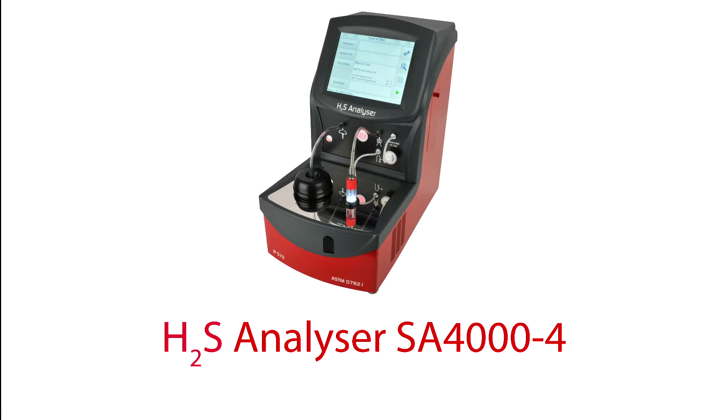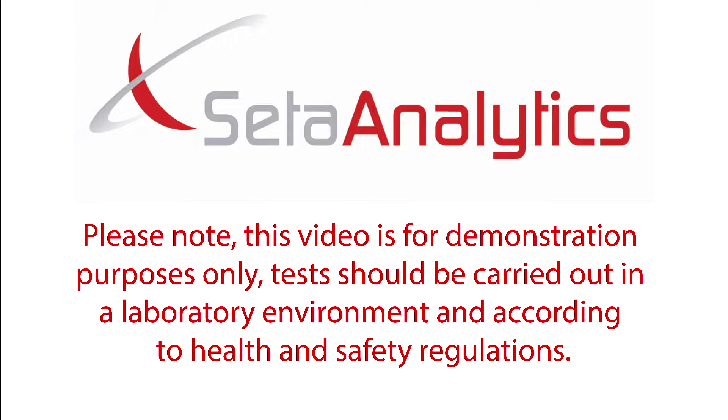Hello and welcome to your new Stanhope CETA H2S Analyzer SA4000-4. Please note, this video is for demonstration purposes only. Tests should be carried out in a laboratory environment and according to health and safety regulations.